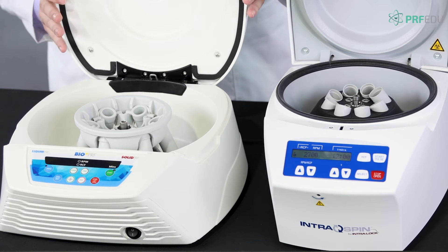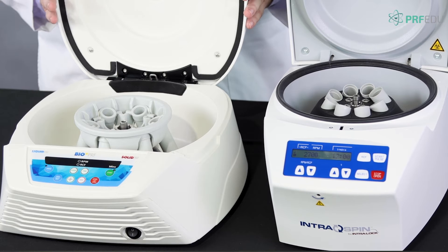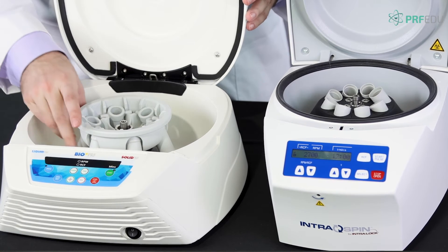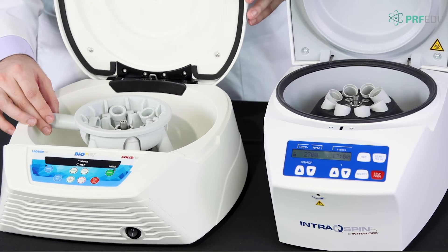The horizontal centrifuge is a little different — each position is a swing-out bucket. The tubes go in upright, but when spinning they actually swing out to a 90-degree angle.